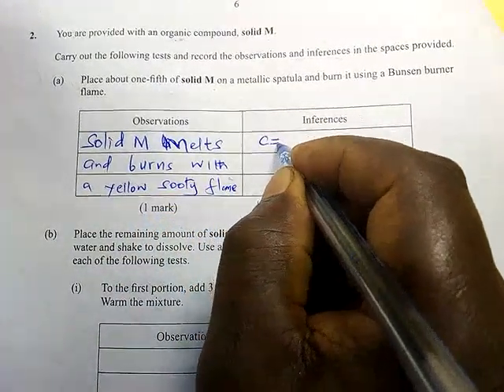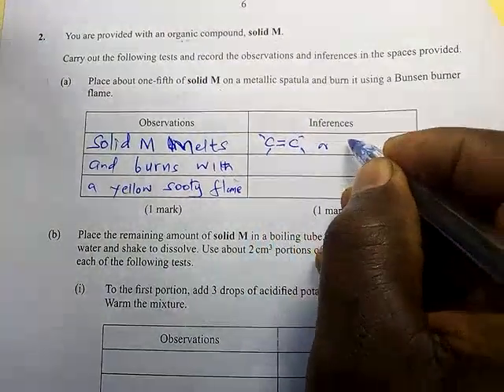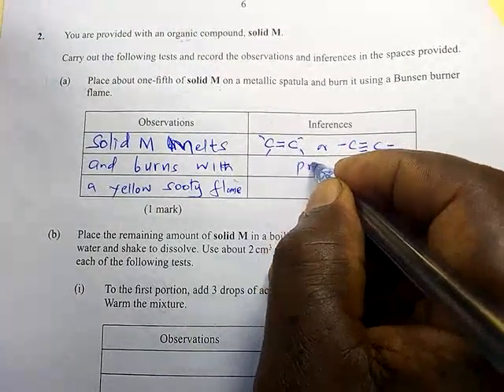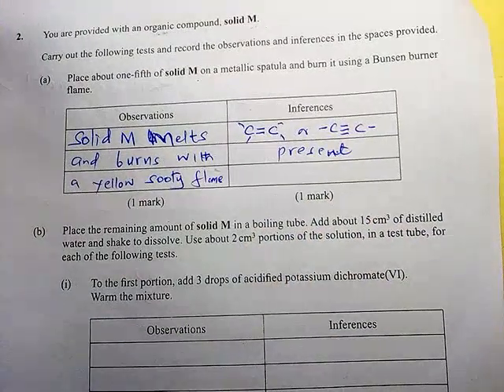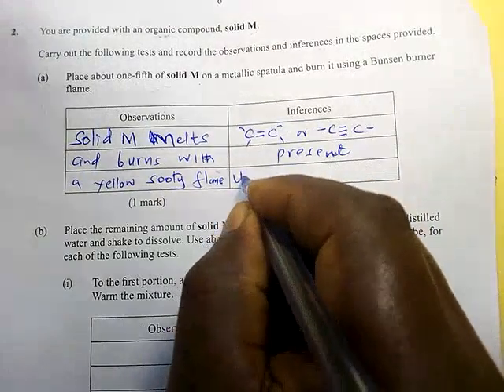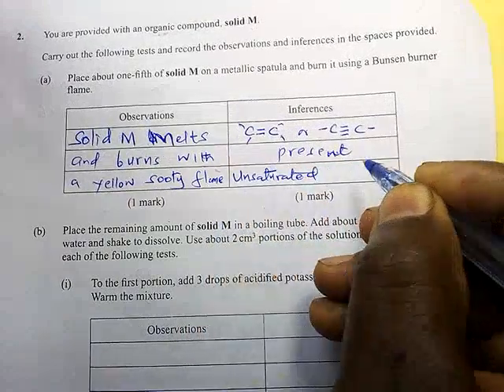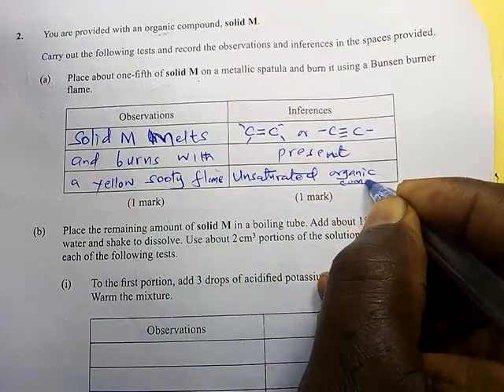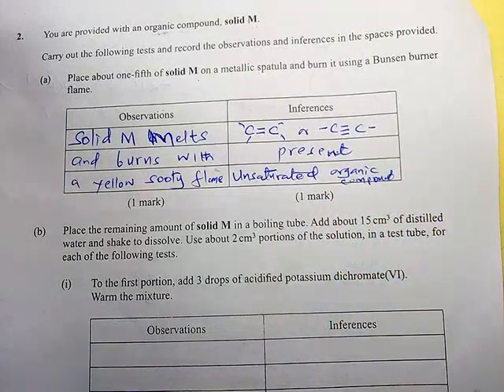The double or the triple bond present. Someone else can say unsaturated organic compound present.